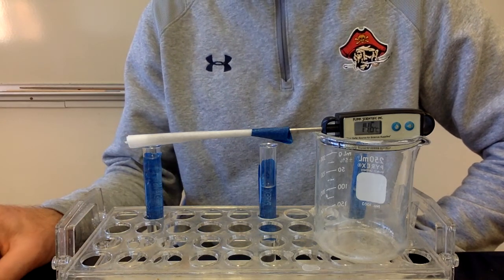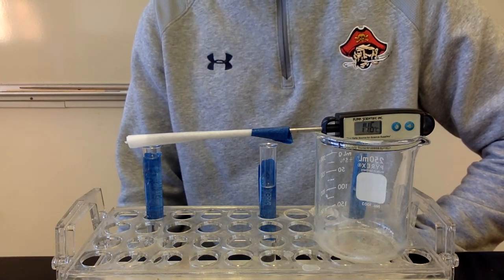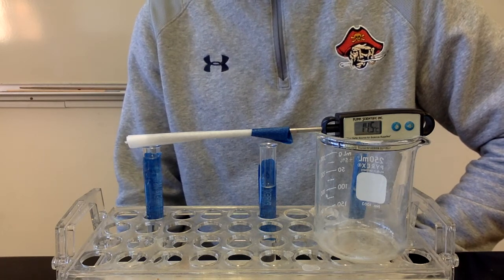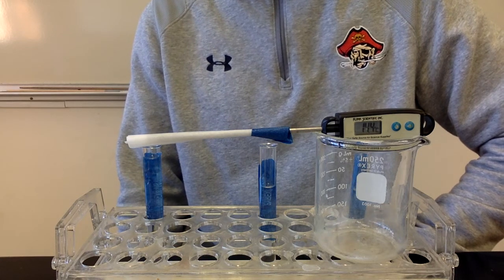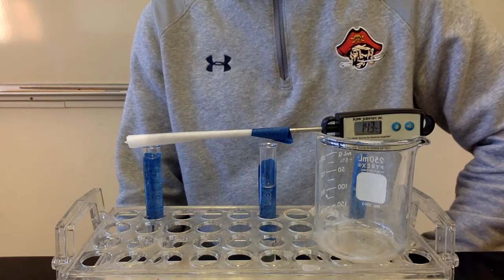All right, so continue every 30 seconds. You need to record the temperature, and then that's going to give you the data that you need to make your graph, with time on the x-axis and temperature on the y-axis. It's continuing to get colder and colder as the water continues to evaporate.